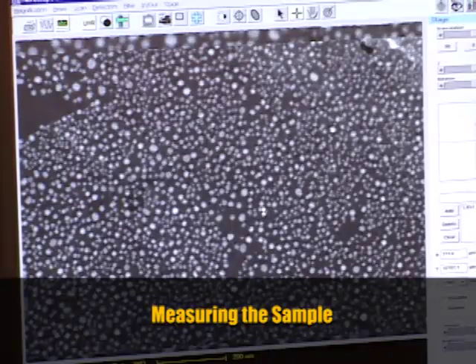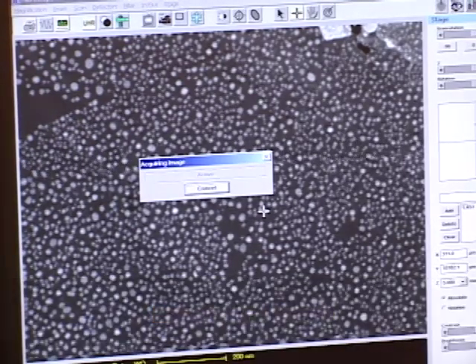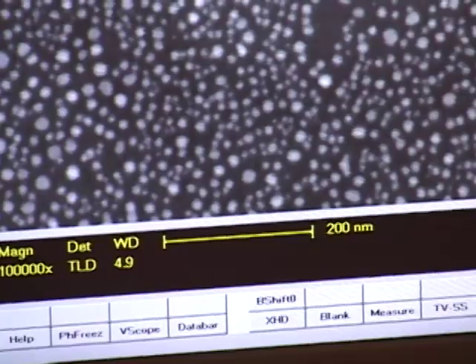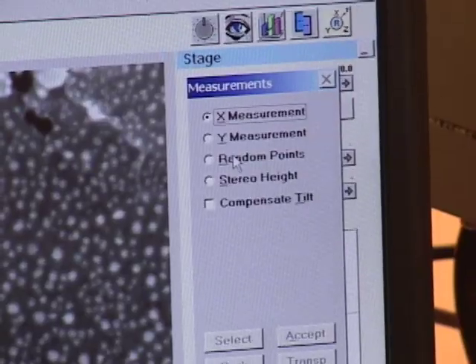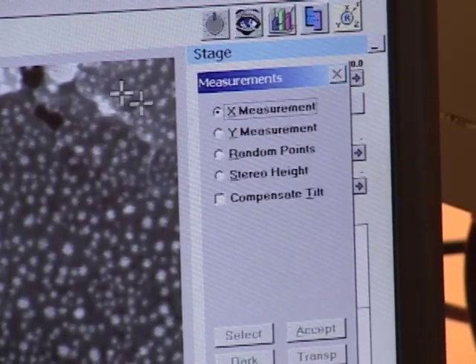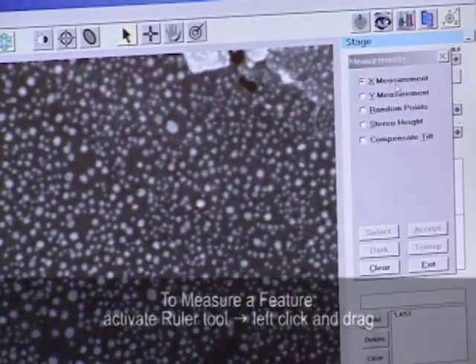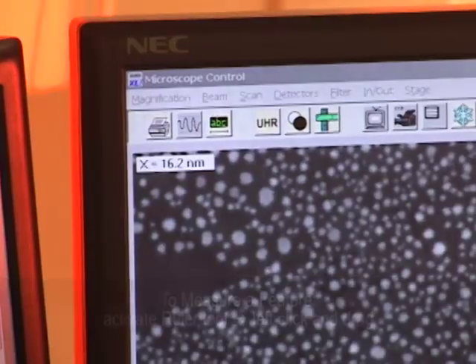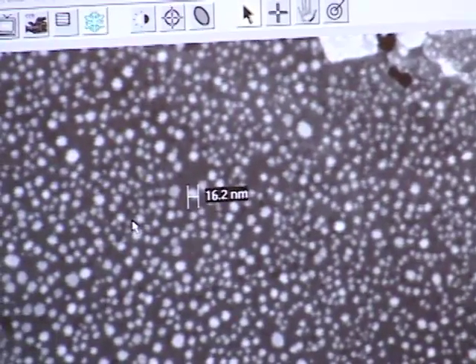When you zoom in, bring it back to center and focus. If I want to take measurements, I want to work from a frozen picture so there's no movement. So I'm going to scan this image and then show you the measurement tool. In addition to the scale bar across the bottom that measures two hundred nanometers, I can also use this ruler tool which brings up a measurement menu. I can measure along the X axis, Y axis, or random points. I like to change to the pointer instead of the crosshair icon. I'm going to measure a horizontal nanoparticle along the horizontal element — I just left click and drag from edge to edge. This is measuring sixteen point two nanometers. If I wanted that to appear on the picture, I click accept and the picture is labeled with sixteen point two nanometers as the diameter of this individual particle.